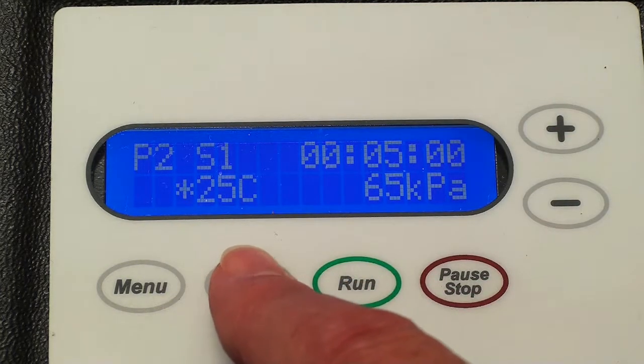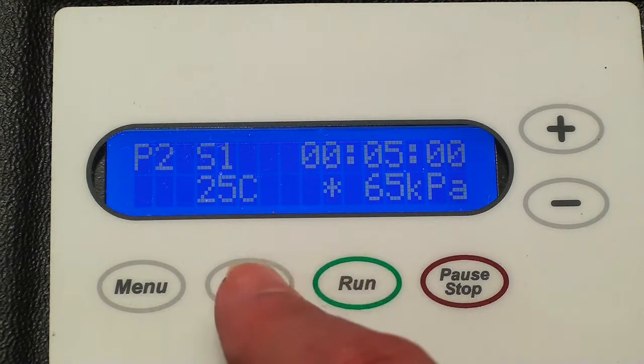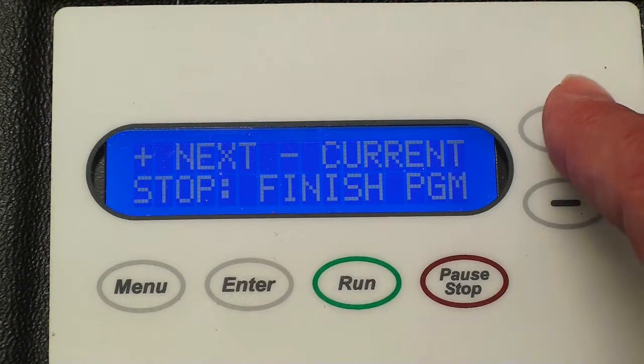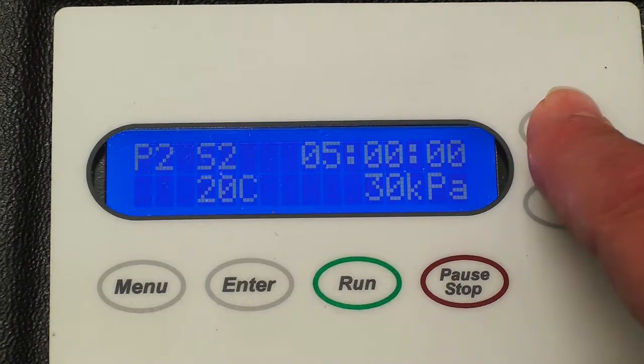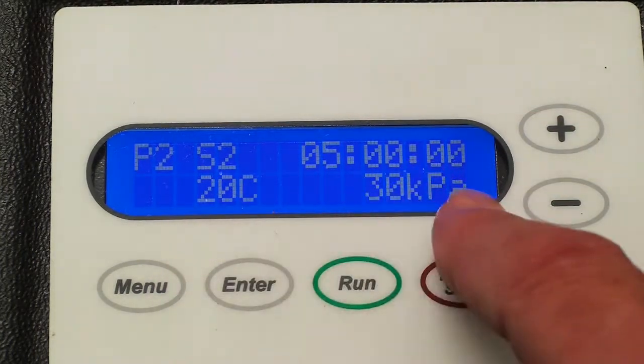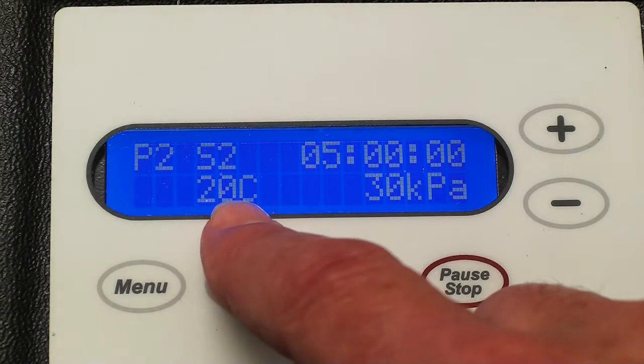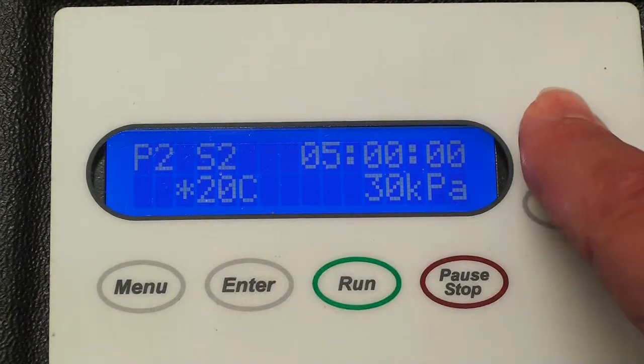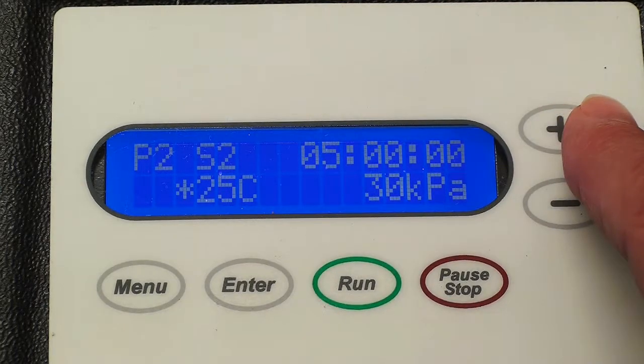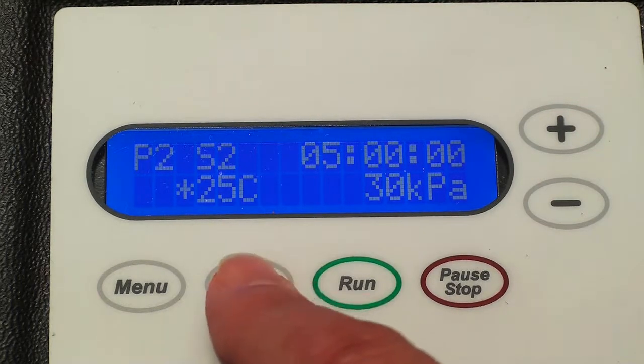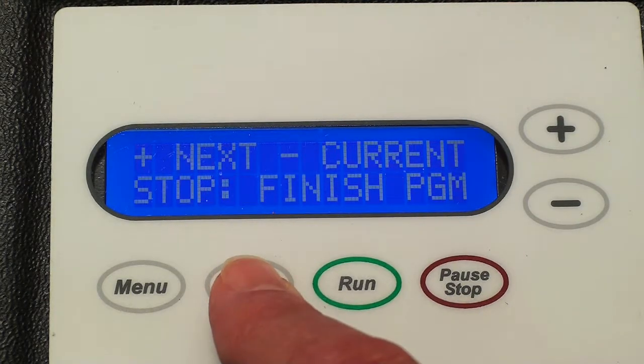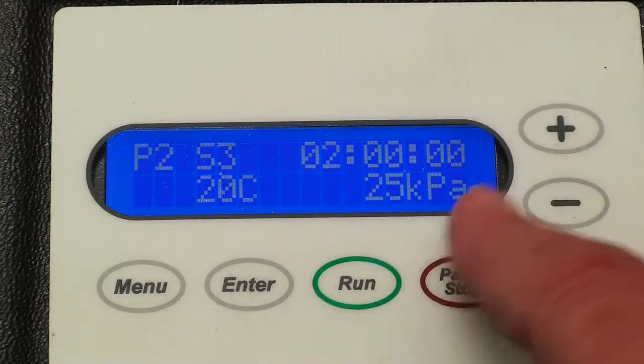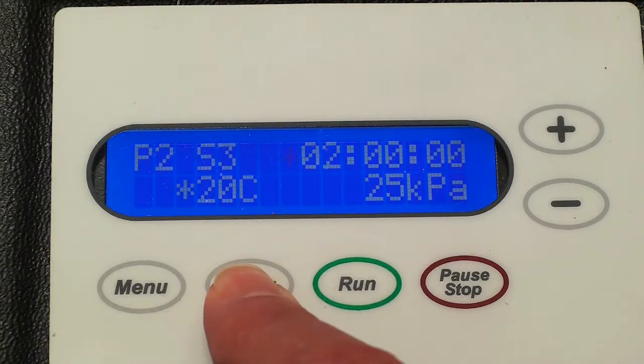The 65 kilopascals is good enough for the very first step. So I'm going to go to the next one and just push the plus and that goes to the next. So now it's step 2 and that's 5 hours. And again, I want to change this so I get 25 degrees. So I push the enter until the asterisk goes there. Change the number. And then for step number 2 with program 2, I want 30 kilopascals. And I want to make sure that all of my different steps go to the 25 degrees centigrade. So here we can see for 2 hours, for step 3, I'm going to go to 25 degrees centigrade as well.